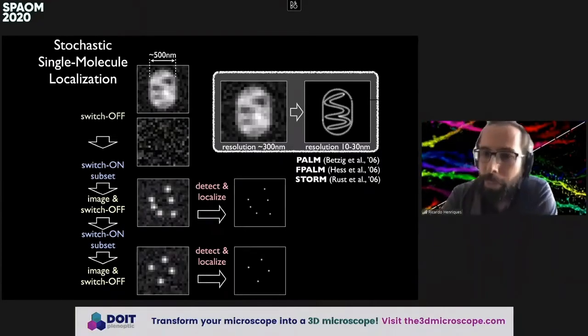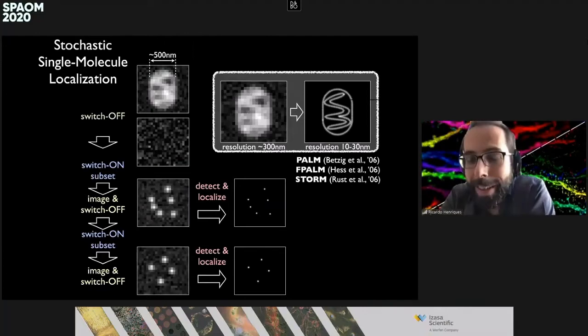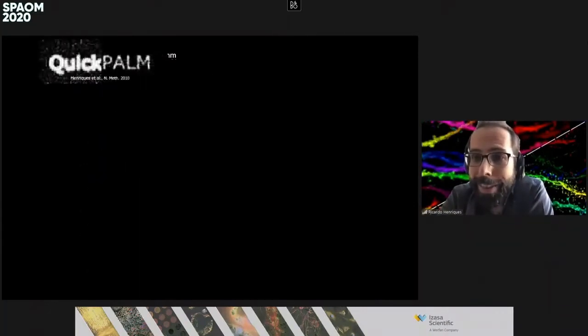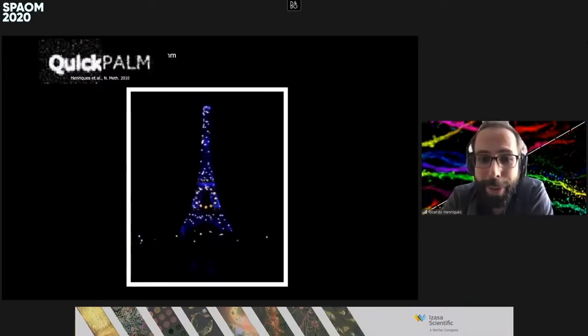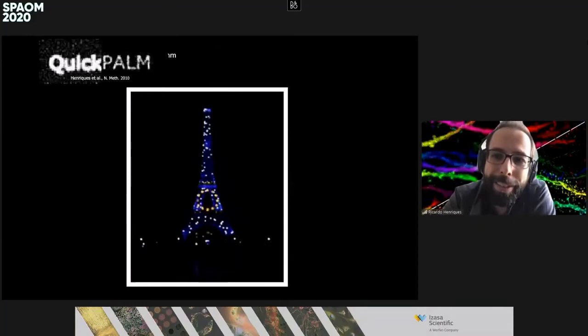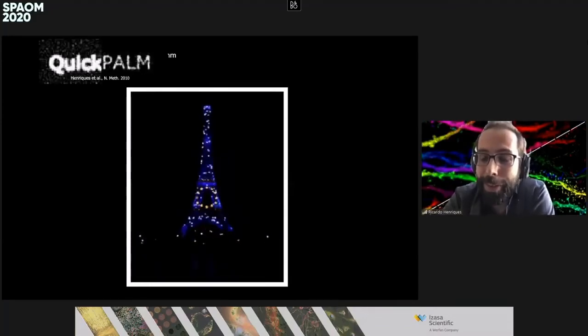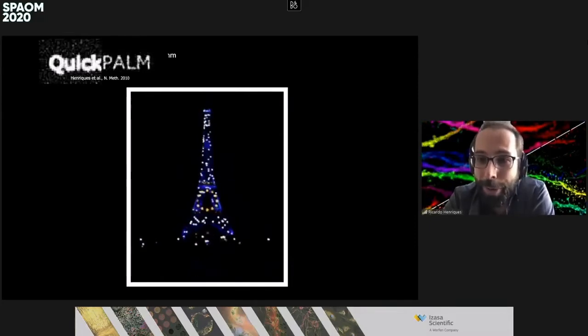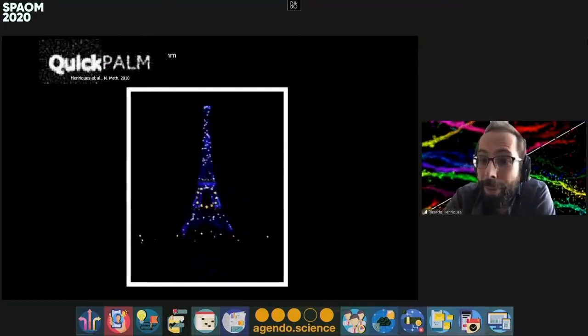So this is what I got into as a PhD student. It was fun because I remember starting to build microscopes to do this and looking at novel probes that were able to create these blinking events. I did that while I was in Paris. One night I was invited to a picnic in front of the Eiffel Tower, and I saw this. The funny thing is that I was really annoyed when I saw it, because I was already spending 8 hours in front of a microscope trying to get cells to blink, and I didn't want to see anything blinking in my free time.